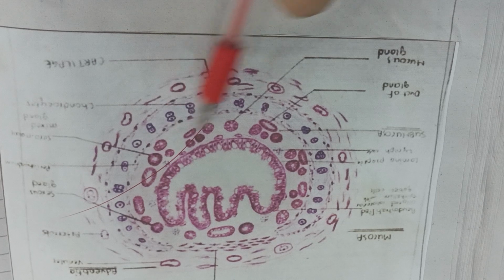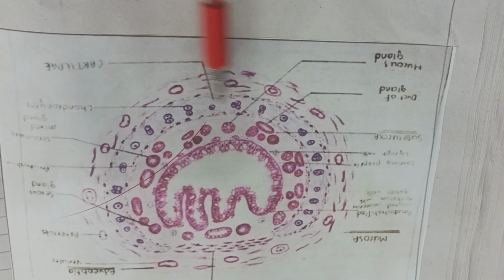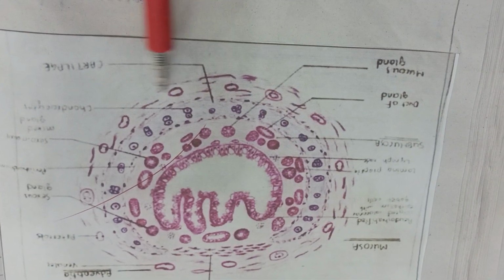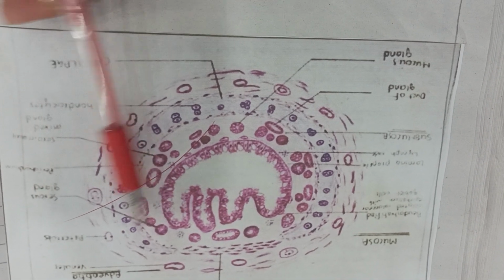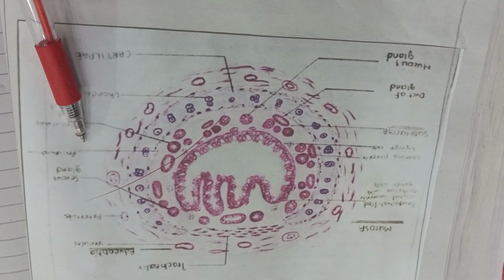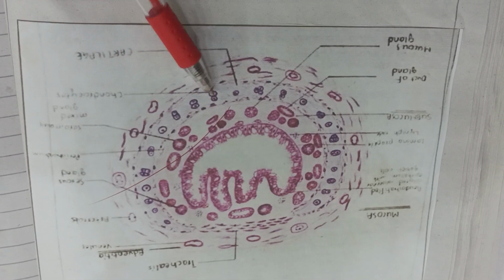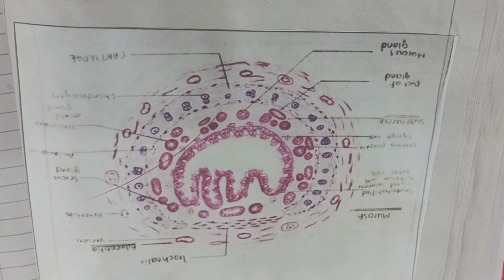The submucosal layer is this layer. It has a lot of ducts of various glands. Mucous glands are also present. After this ducty layer, you can see this C-shaped layer. This is the cartilage, and after this cartilage you have the adventitial layer. Seromucous glands are also present in the submucosa, and this is the perichondrium. Chondrocytes, which are the cells of your cartilage, are also present in your cartilage. So this was also the structure of the trachea.